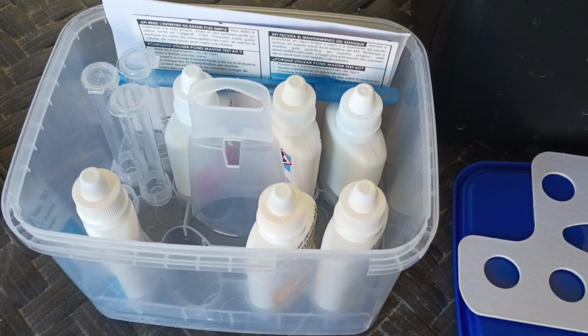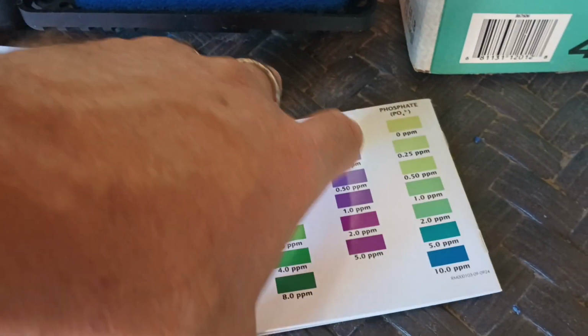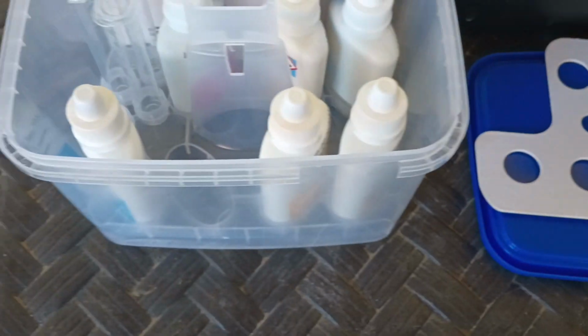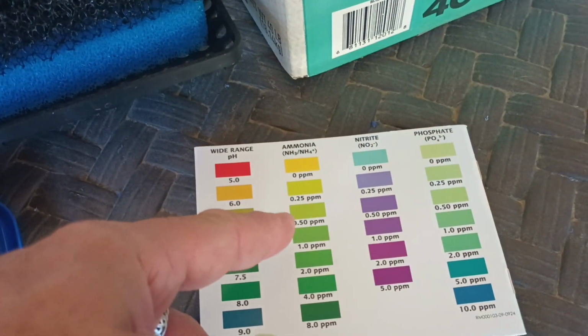Well, hey folks, I bought one of these master test kits here for my little fish pond. Ordered it on Amazon, the API. I'm going to go ahead and test everything. I just tested the ammonia. The second one here is the ammonia.